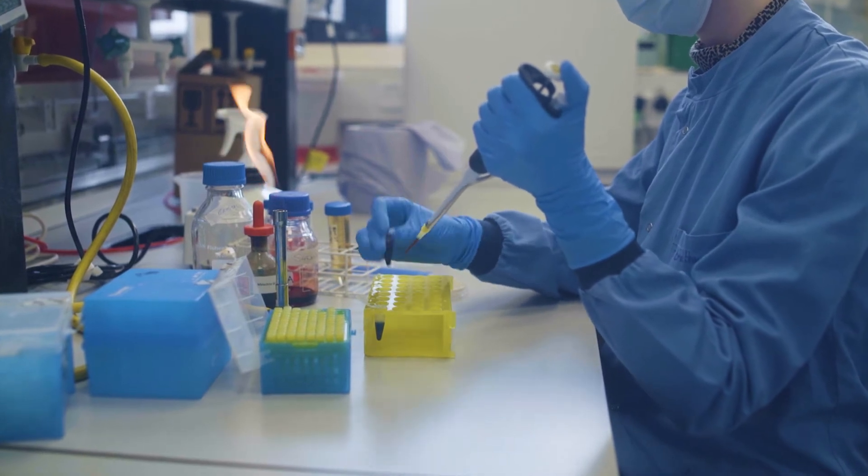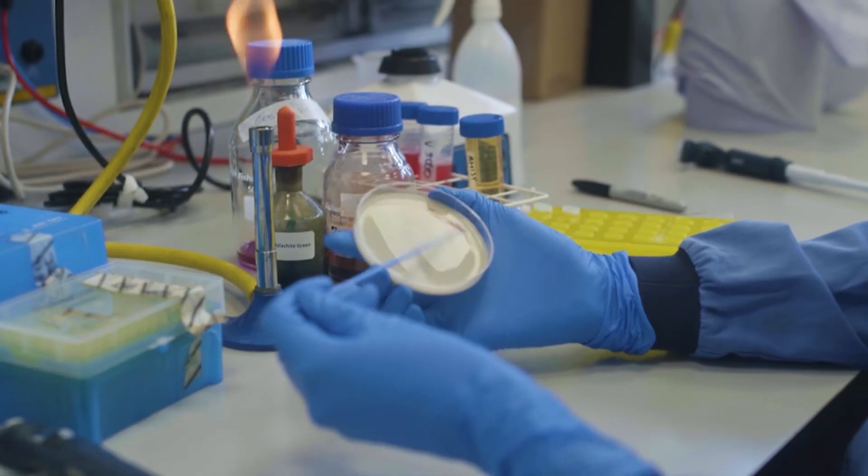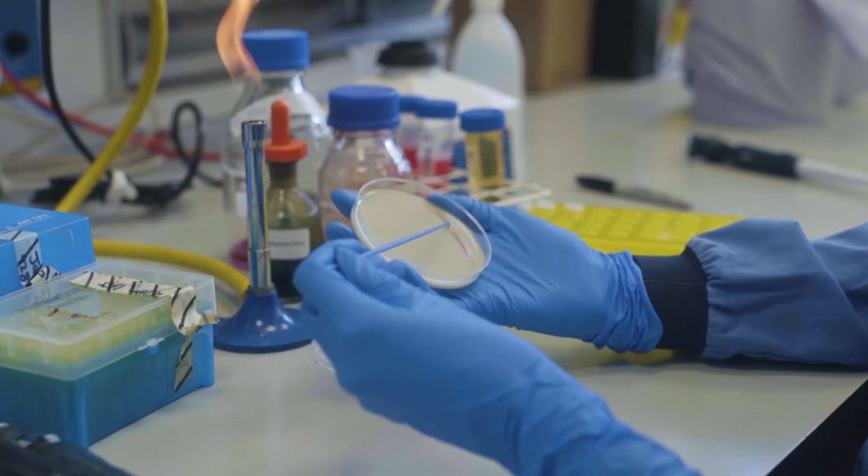The Don Whitley cabinet is excellent for this because it allows us to grow optimal amounts of Clostridioides difficile from very small samples.